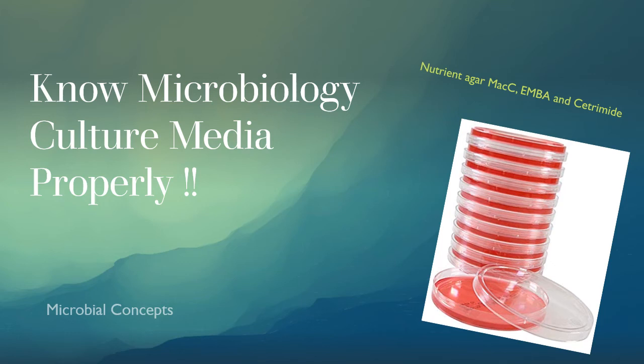Welcome back. So this is a video related to the culture media that we use daily in microbiology practicals, from first year to third year. Knowing culture media properly is very important because you get a lot of questions in Viva.